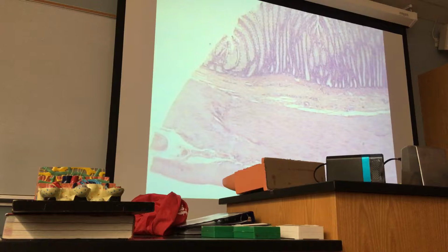Fantastic. All the 4 different layers, starting from outside. Here's the dark line. Can you see the dark line? That is the serosa. This is low magnification.